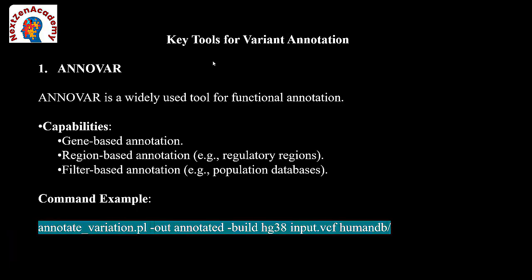If you want to do a population-based analysis, the details can be mapped with population databases like gnomAD, ExAC, or 1000 Genomes.